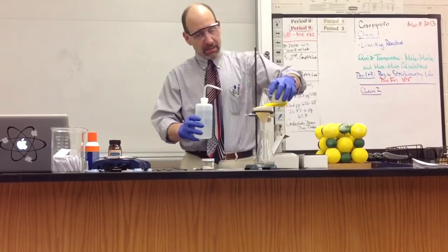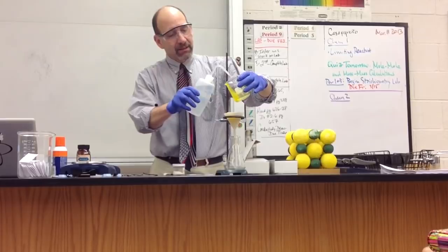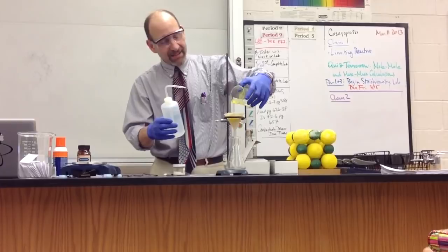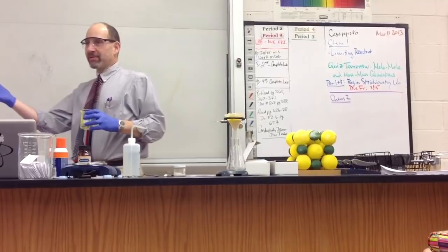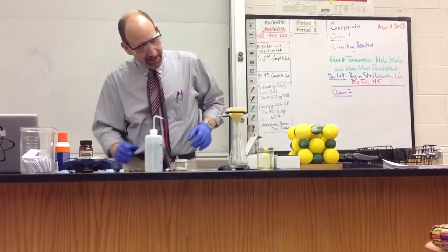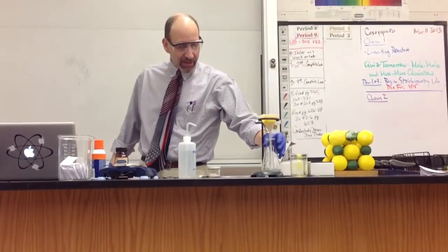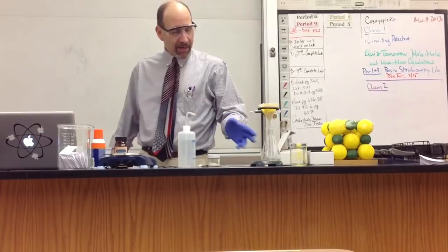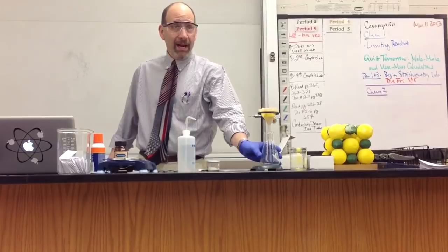All right, so the next step is to do my filtration. I'm going to filter all that beautiful yellow salt. And one of the things you would have seen is on the side bench tomorrow, if we had done this as a class, there would have been 12 of these very pretty filter papers with very pretty yellow salt on it that we'd have to mass out. All right, so what I'm going to do now is let this filter and we'll come back and take a look at it. One of the things I'm looking for here is that the liquid coming through is supposed to be nice and clear, which it is.